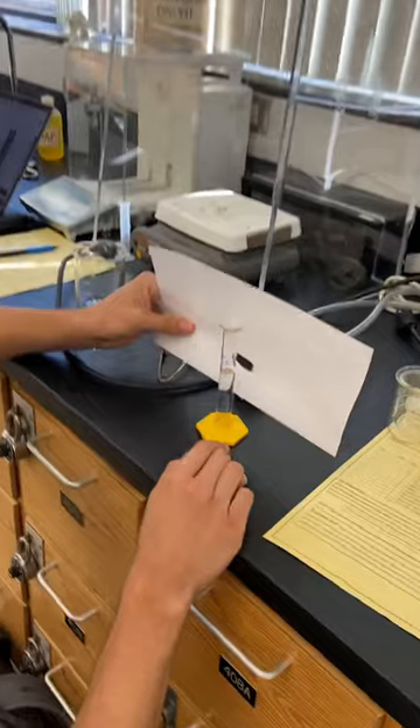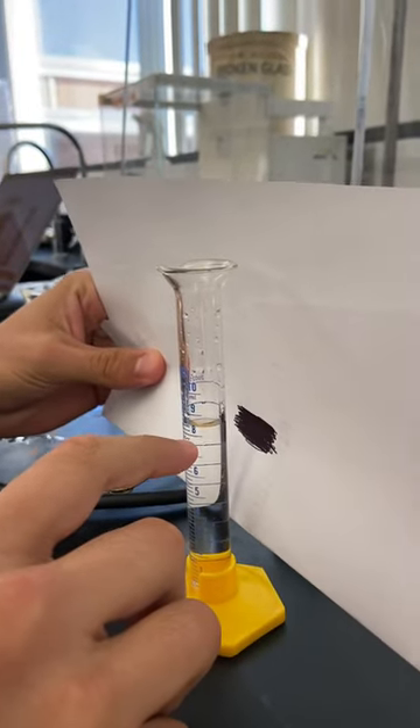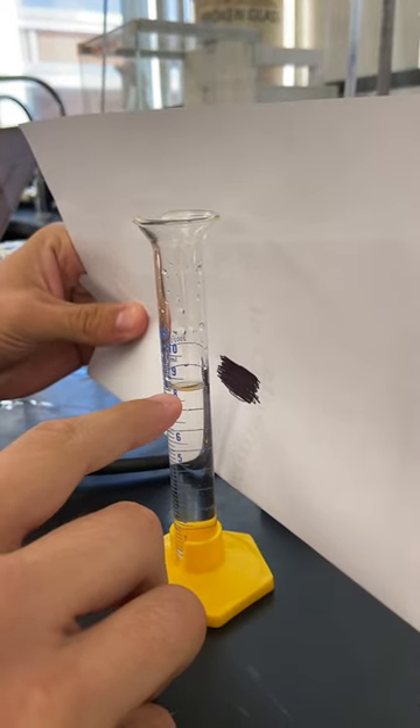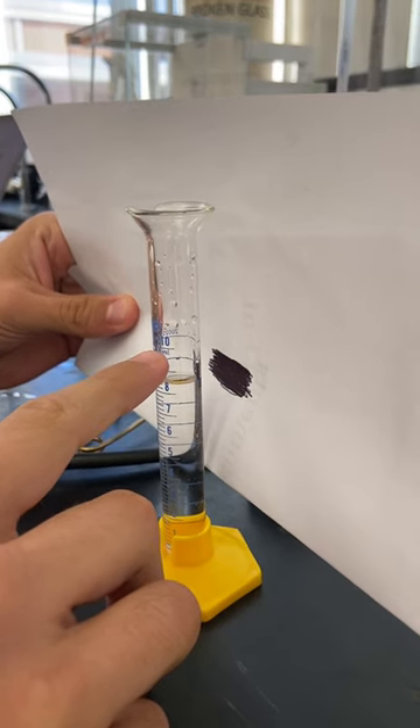Right here it's between 9 and 8 milliliters, but because it's less than 9 we're going to go with 8. So if we see the crest — the bottom part — we can see that we have 2, 4, 6, 8, and then 10 for it to be 9.